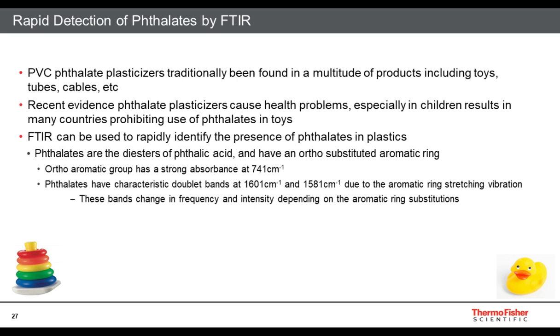And in an industrial setting, we see FTIR used in many different industries. It's a very useful technique that pops up almost everywhere. But one of the big ones lately has been for the rapid detection of phthalates. We worry about phthalates in consumer products, and especially when it comes to baby and small children's toys. We want to keep phthalates out of there. And FTIR, especially with ATR, is very useful as a fast screening tool.